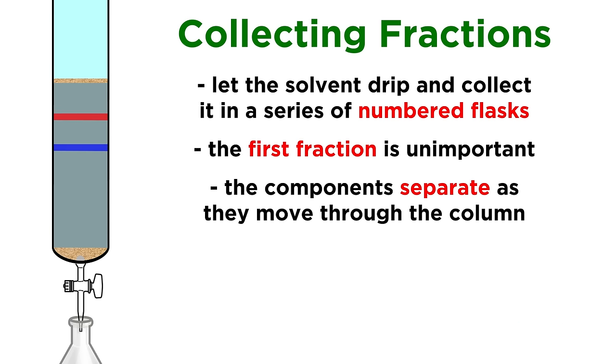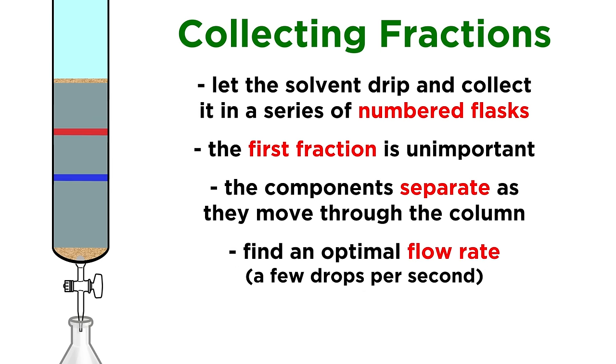As we push eluent through the column, the components will begin to move with it, and separate as they go, just like what happens on a TLC plate. Try to find an optimal flow rate. We can't go too fast or too slow, or it will not separate properly. Just a few drops per second should be fine.